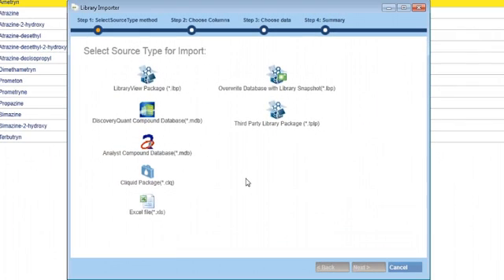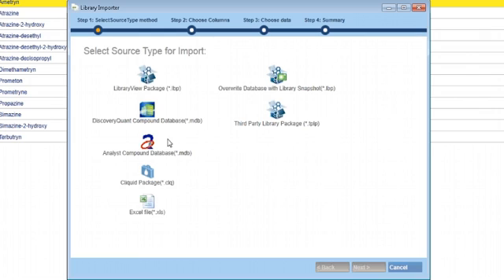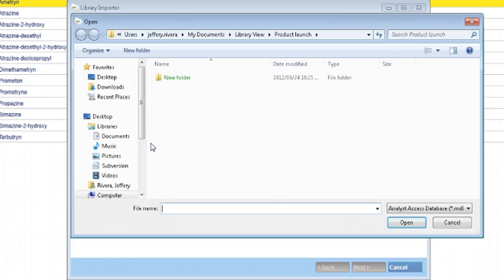Once you've clicked on the import button, a library source type window will come up. As you can see, there are a variety of library formats supported in LibraryView. For this example, we'll select an analyst compound database, but the procedure is similar for all file types.